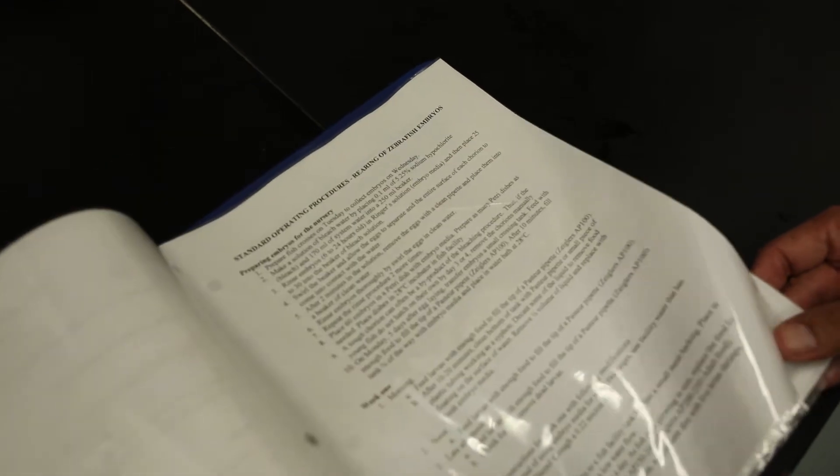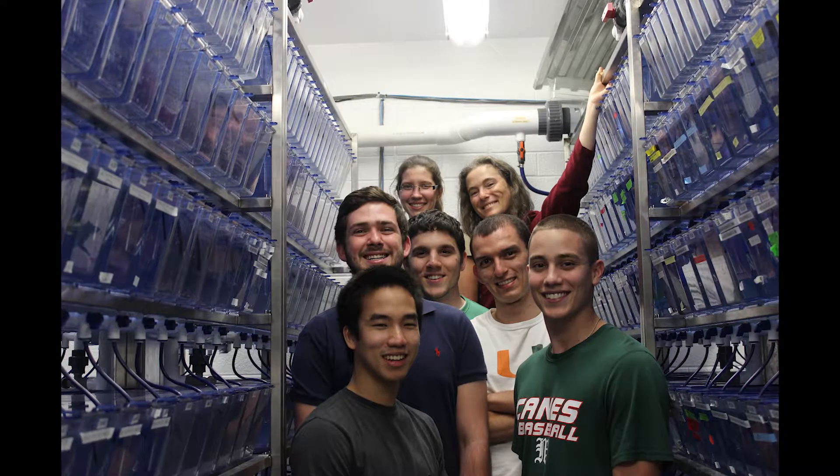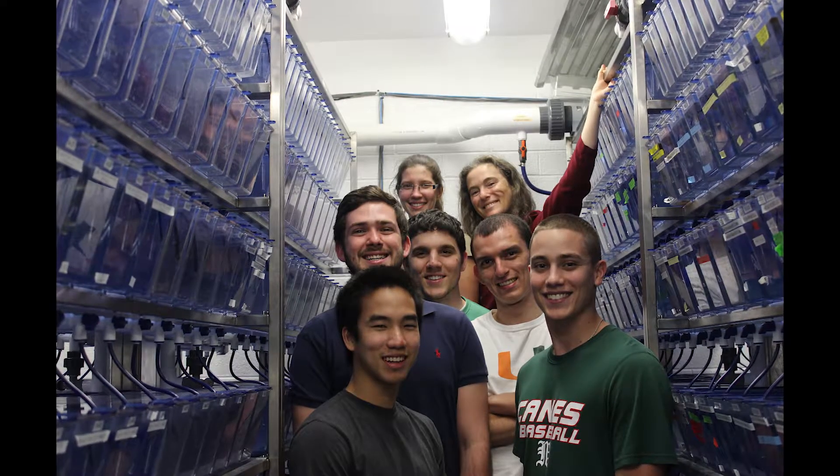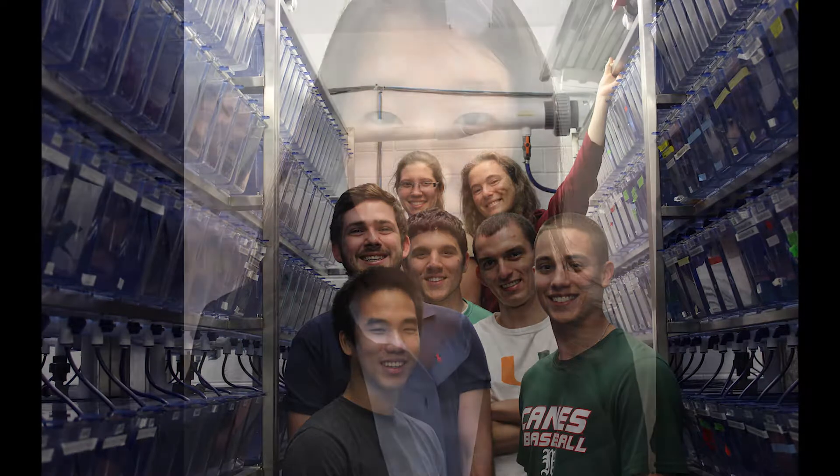The facility also has SOPs for hurricane preparation, water shutdown and turn off, food preparation, system maintenance log, sick and dead embryos, white-eye crossing log, etc. The facility team consists of one director, the facility manager, and two work-study students. Graduate and undergraduate students also help to keep the facility running in good conditions.